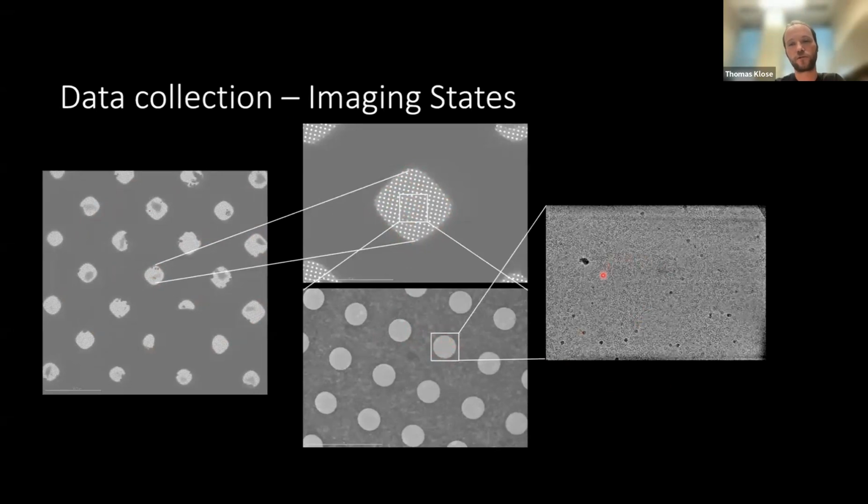And then at the end of it, one takes a snapshot in this hole and sees the sample, which again, like this is a very good distribution of sample in the ice. It's probably hard to see, but there are lots of tiny protein molecules there. And then you repeat that many, many times over until you have thousands of images taken.